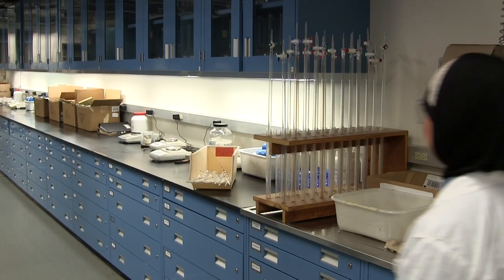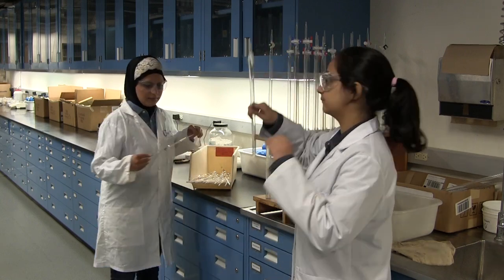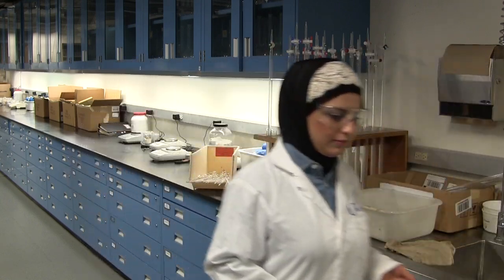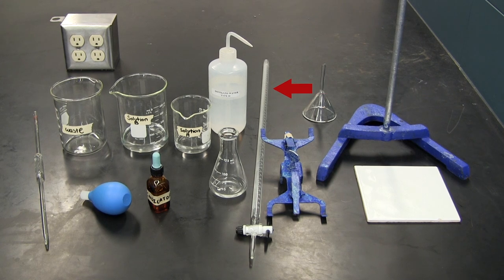Now obtain a 50ml burette and attach it to the burette clamp. Check if the stopcock is open — you don't want to spill your chemicals on your workbench. When horizontal, the burette stopcock is closed; otherwise it is open.